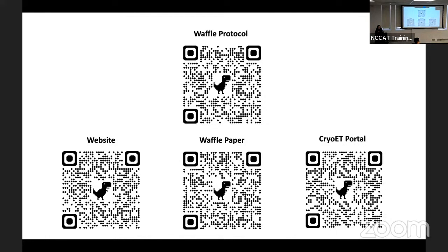Okay, officially, yeah. What's your success rate with unclipping a grid? 100%. No, seriously, every time I've done it, I mean, one of them was already messed up and it was almost impossible to get it out, and it was still messed up afterwards. So I was like, it wasn't me, it was already messed up. But all the other ones, like, I accidentally once clipped all of them, I think they were waffle grids, improperly. I put the carbon side down, so when it went in the Aquilos, I was faced with the carbon side, and I wanted the opposite side. So I unclipped all of them and reclipped them and they were fine. It's just tedious, but it can be done.